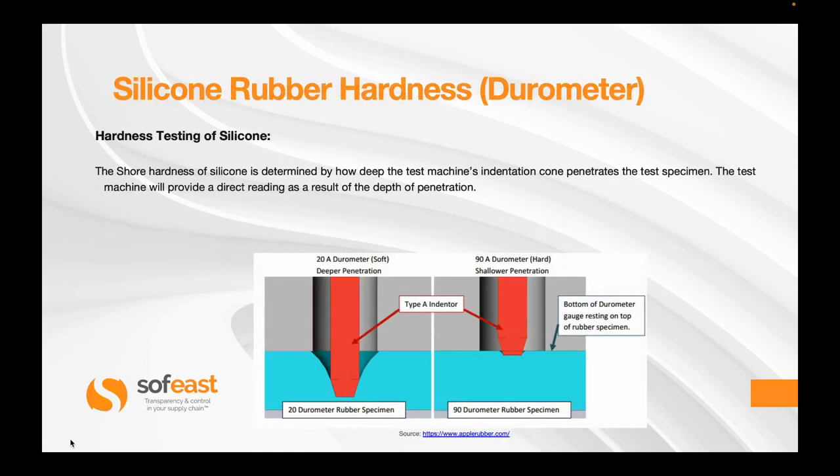Now let's have a look at how this looks from a test point of view. The shore hardness of silicone is determined by how deep the test machine's indentation core penetrates the test specimen, and the test machine will provide a direct reading as a result of the depth of penetration. On the left we have a 20A durometer, which is a soft material — you can see quite a bit of indentation or penetration from the cone. Whereas on the right hand side we have a much harder material with a reading of 90A, which shows a more shallow penetration.